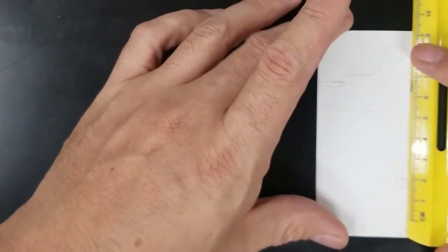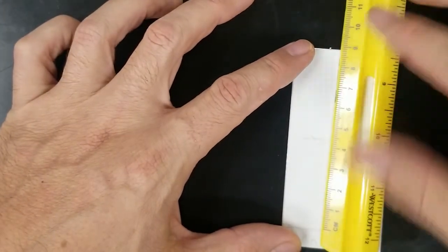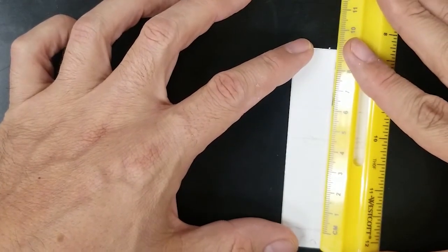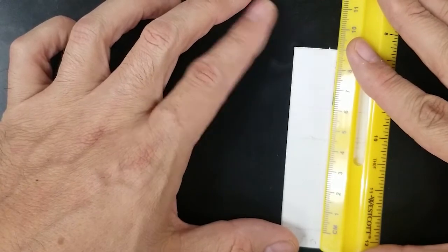Okay, same deal for the next two. Remember, the next two are on a different plate, so their solvent front is different. Let's go ahead and get the solvent distance first. And let me grab the salicylamide distance too while we're at it. Okay, there's the one for the solvent front. It looks to me to be pretty much exactly at 6.